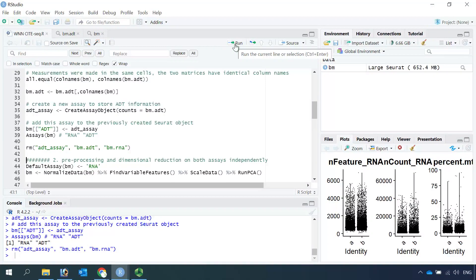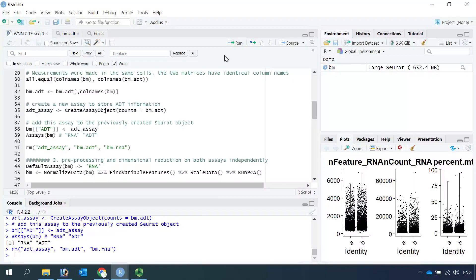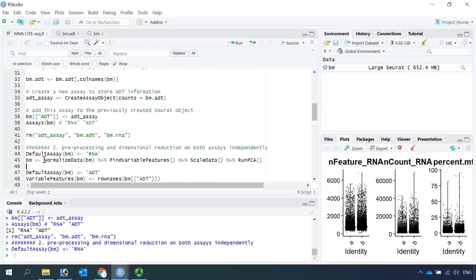Next we can perform pre-processing and dimension reduction on both RNA and ADT assays. First let's do it for the RNA-seq data. We set the default assay as RNA, then perform data normalization, find variable features, scale the data, and run linear dimension reduction (PCA) for the RNA dataset.